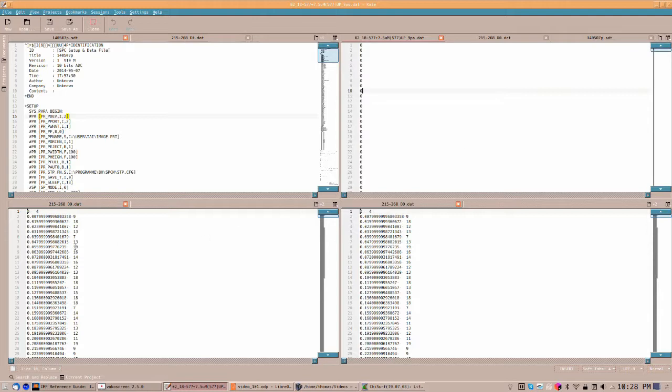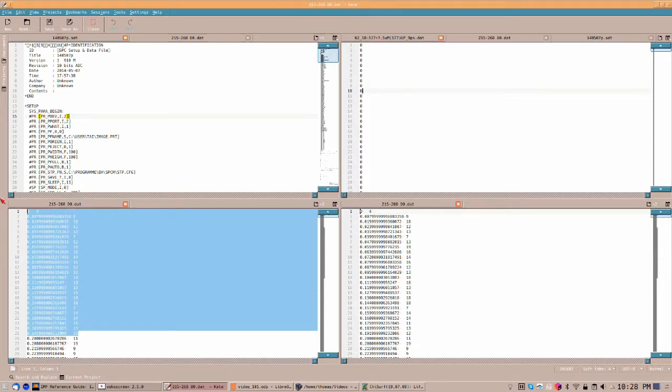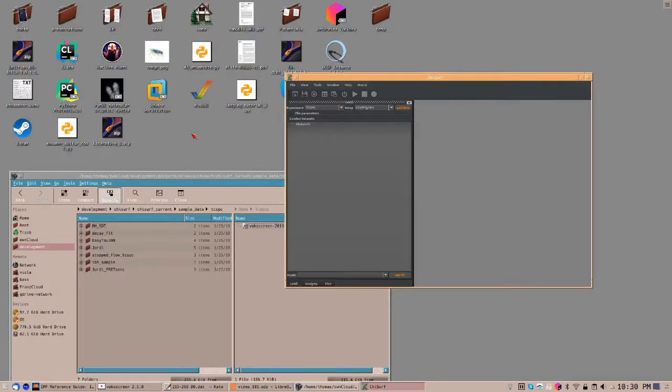The most common formats, however, are two-column formats, where either the first column is a time axis or a count rate axis. Here, the first axis is a time axis and the second axis is a count rate.